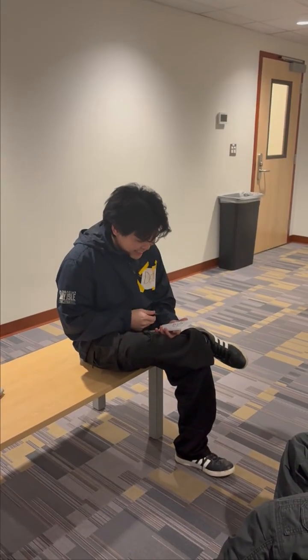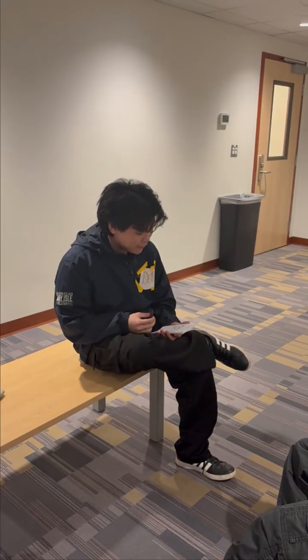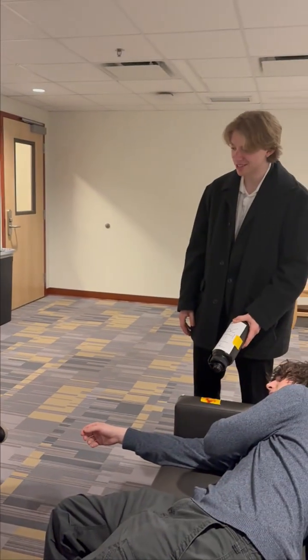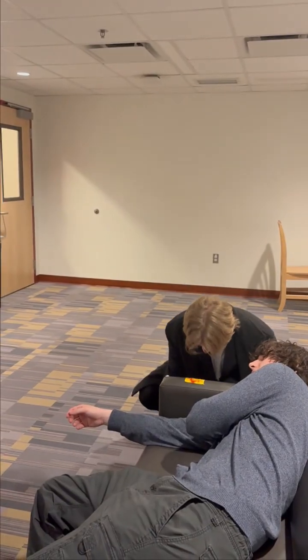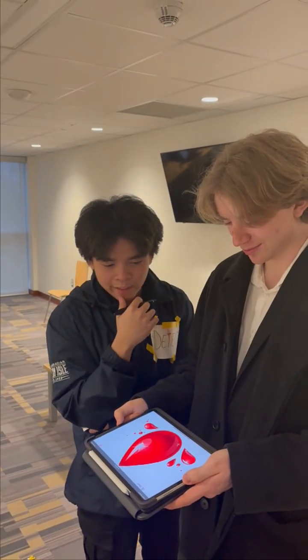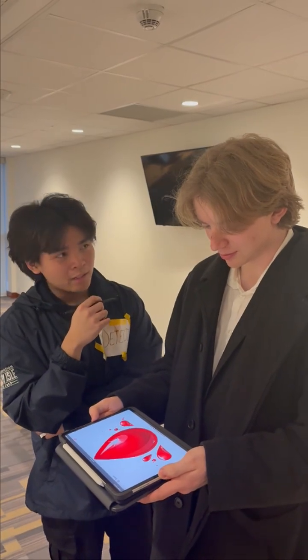Oh, I see. It's better than regular IR spectroscopy because it is able to differentiate between multiple signals simultaneously. Not bad, kid. You learned fast. Right on cue. Looks like we got our results. What does it mean? We've got blood. And how does it work?